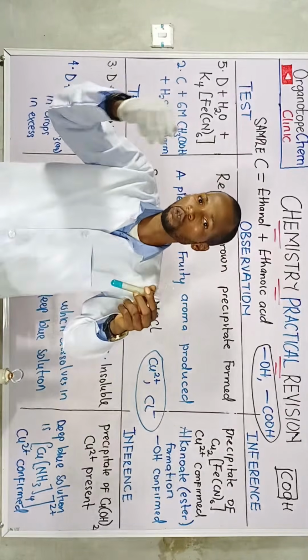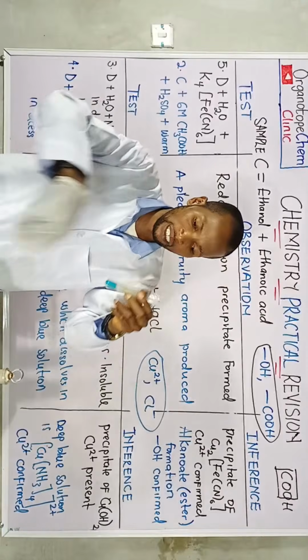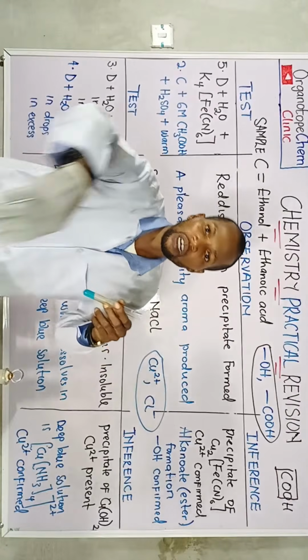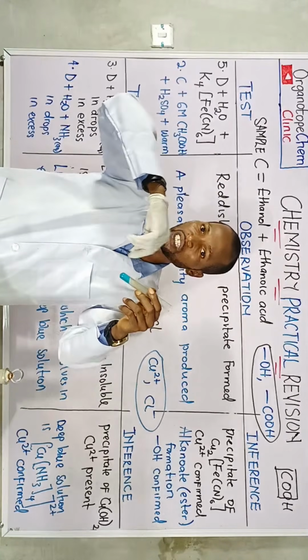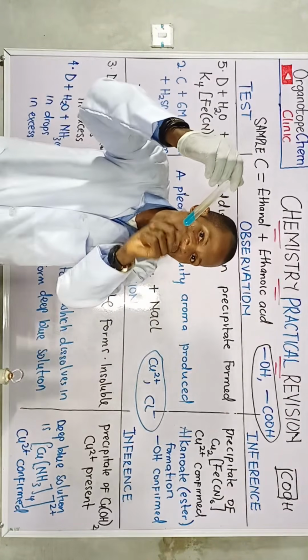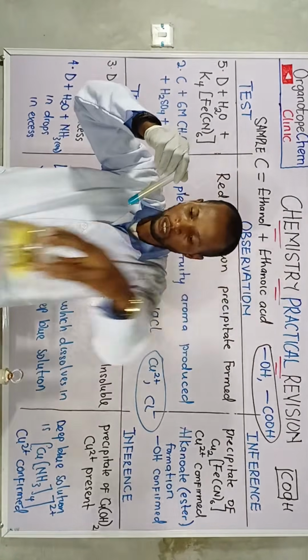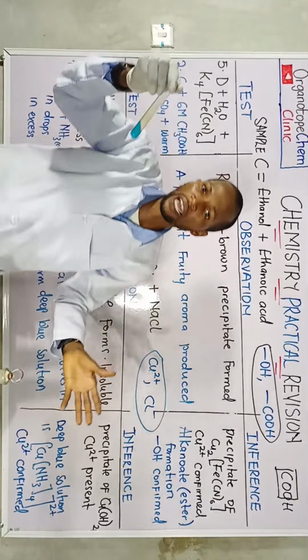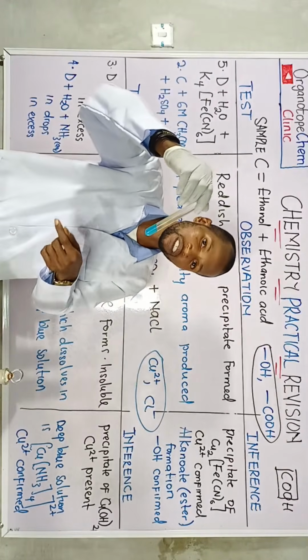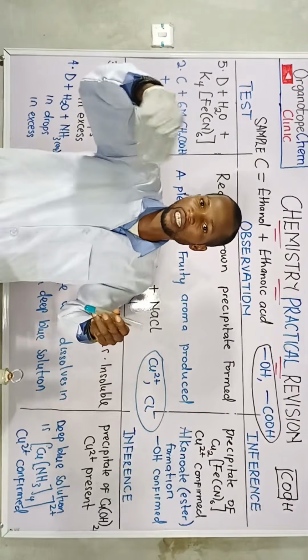So if we are to replace it with another acid, if we attempt to use hydrochloric acid, it will add to the concentration of chloride in the solution, because we already have sodium chloride here. So we are still adding another compound that contains chloride. We are going to see a white precipitate, but that is not a standard test. Is that okay?